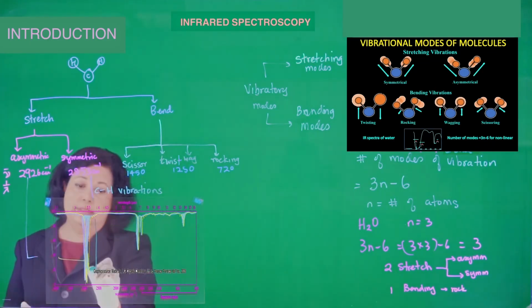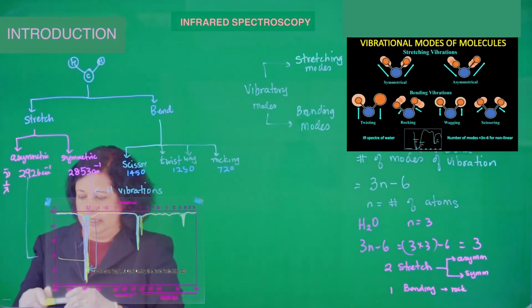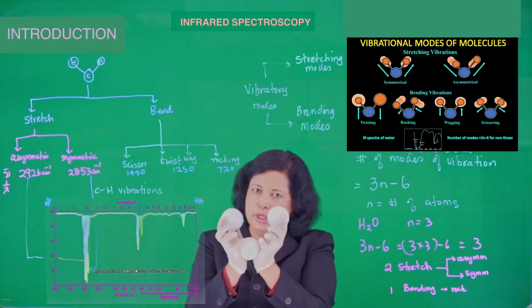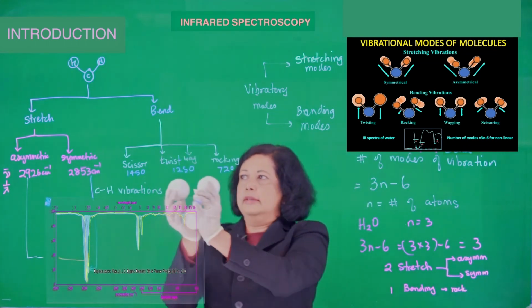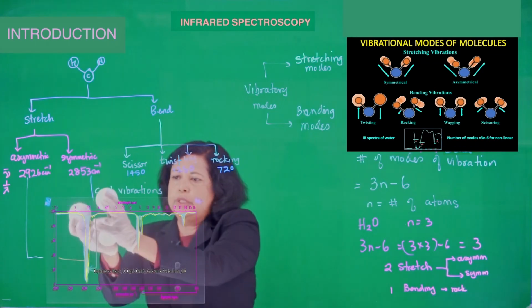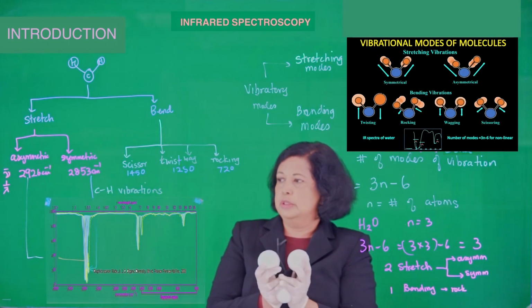Then you have your symmetric stretch. The asymmetric is going to be the higher energy absorption. So the molecule is basically drinking up energy for the asymmetric stretch in here, then the molecule is drinking up in the symmetric stretch in this region. Okay, and that's what you're seeing on the spectra, how much it's drinking, and the intensity shows how much.